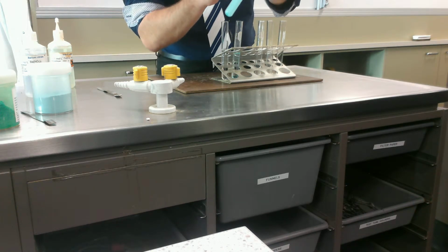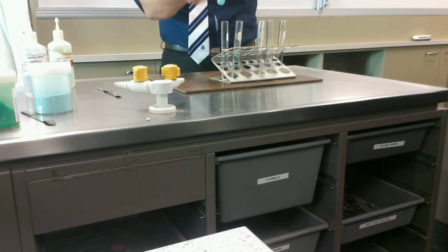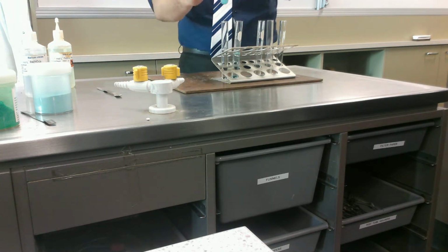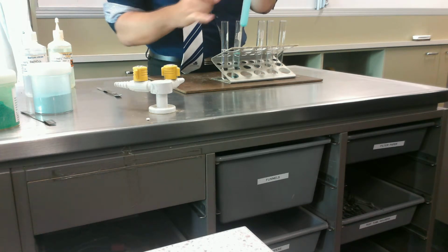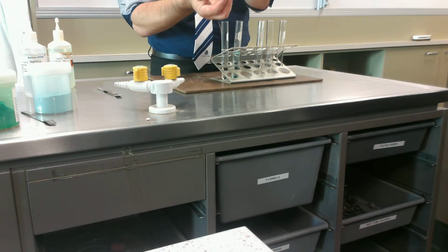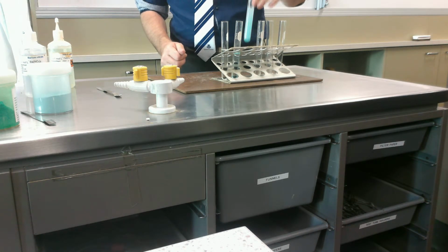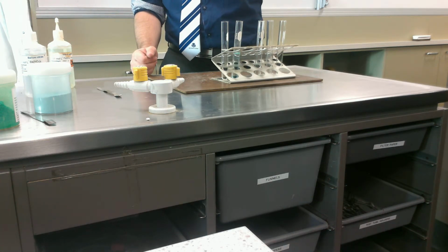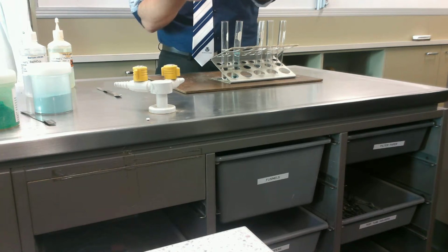When it goes murky, that means that there's lots of little solid bits, too small for us to see each bit, but it's not dissolved, it's insoluble. So that powder has just been spread throughout. If I leave it long enough, the top will be colourless, okay, it'll just be water, and the bottom will have that blue powder just sitting there. So I'm going to leave that during the period. You can make sure I'm not lying to you later. So the reason I want to show you that is this is what we call a suspension. I added a solid and a liquid and it didn't dissolve. So we call it a suspension.